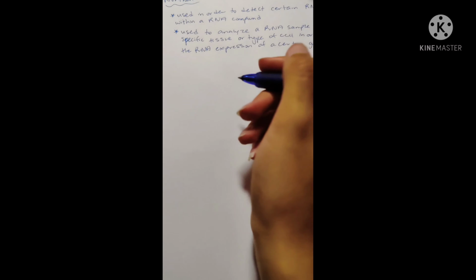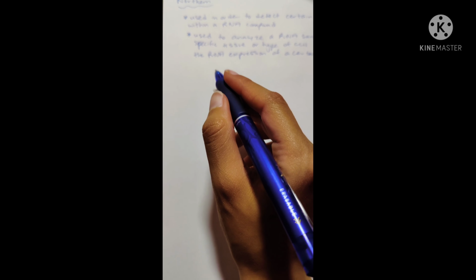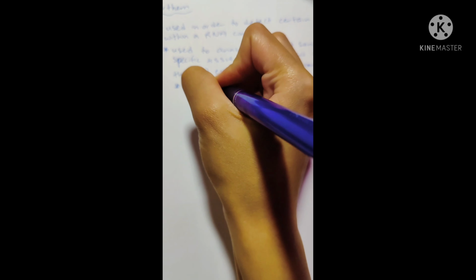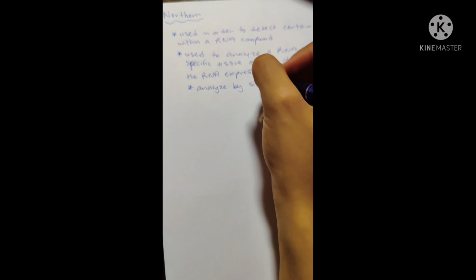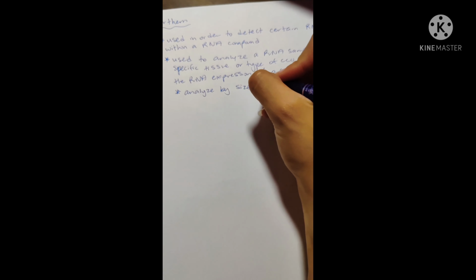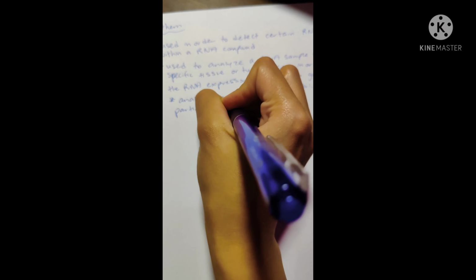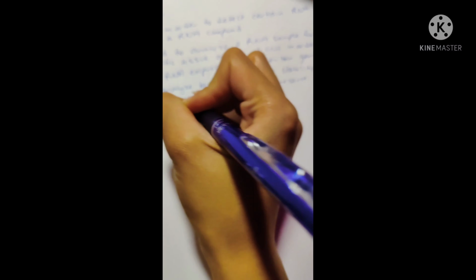Okay. So another thing to note is that this method is able to analyze by size, as well as the stability level of a particular RNA which is present in a complex sample.